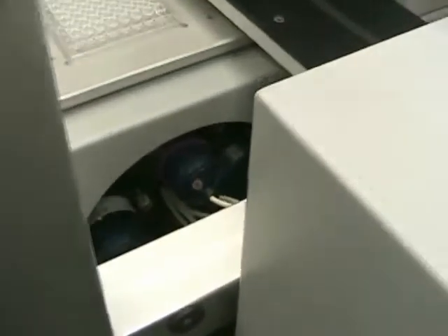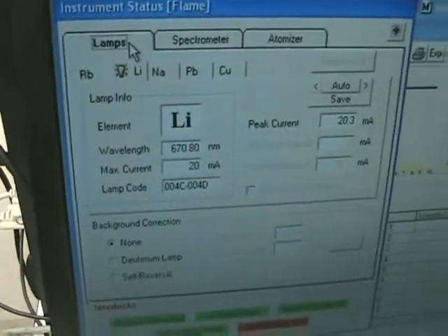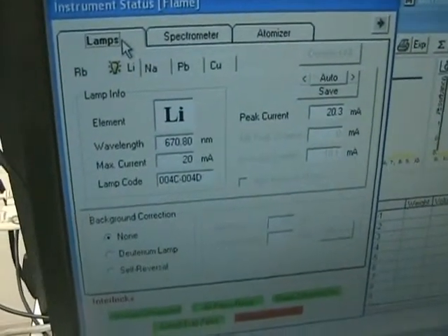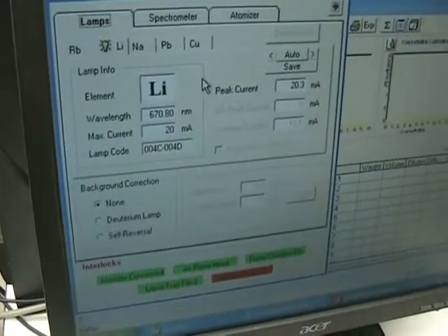If you swing over here — it's a little hard to see — I think we've got three or four lamps installed, and there are actually quite a few lamps we're giving with this one. It's simple: just pick the lamp you want to use and then you can set the wavelength and the peak currents.